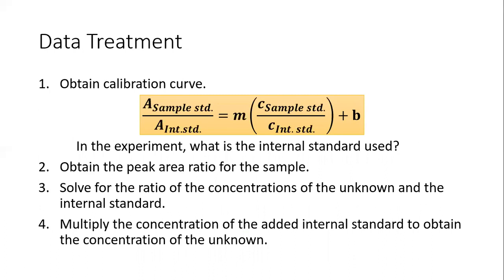And take note that for this experiment, the analyte is ethanol. Your internal standard is acetonitrile.